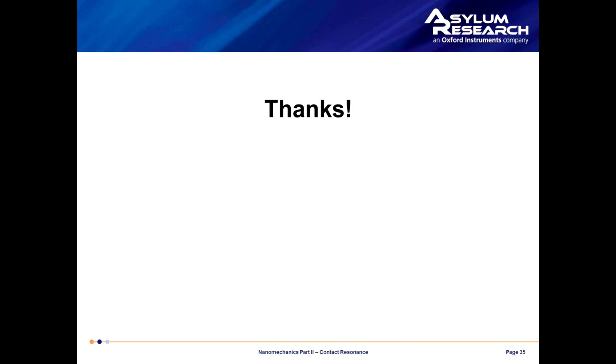Okay, thanks, Roger. Don, a question about the range of the technique. In the presentation, a lower limit of about 1 gigapascal was referenced. What sets that limit?